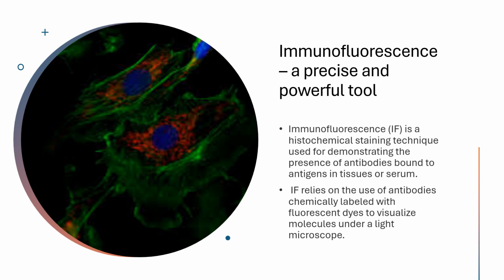There are many powerful technologies and assays that virologists can apply to their research into the structure and function of viruses. One essential and often overlooked aspect of understanding the behavior of viruses is the ability to visualize their effects on host cells. As such, immunofluorescence represents a precise and powerful tool that can be used to observe viral infections and their effects on host cells.